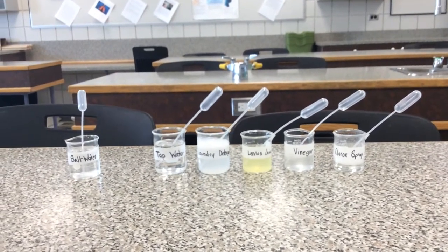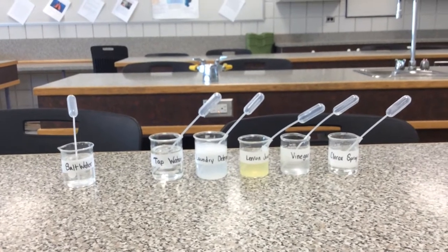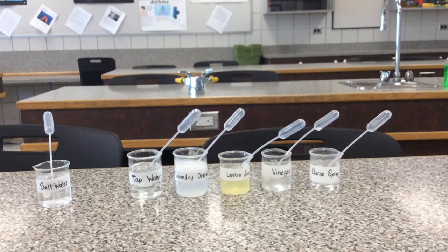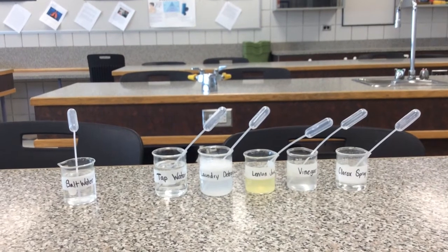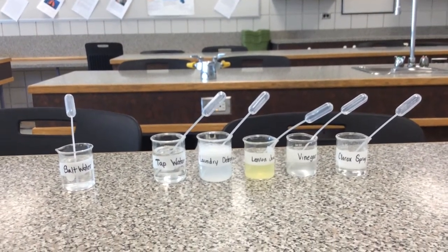Are they acids, bases? Maybe take a quick moment right now to think back in your head and say, what do we think? Do you think vinegar is an acid, a base, or neutral? There are 3 options here. So I'm going to go ahead and get us started on this lab. Feel free to follow along.